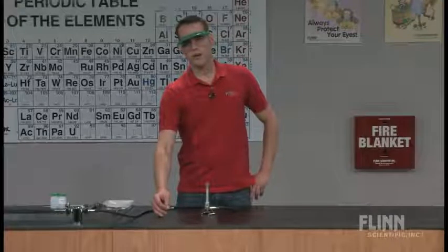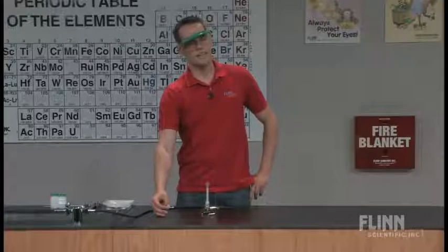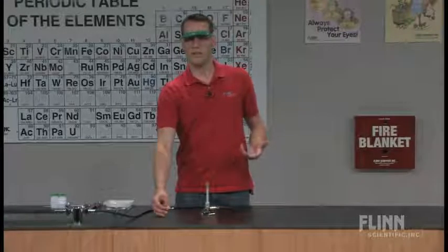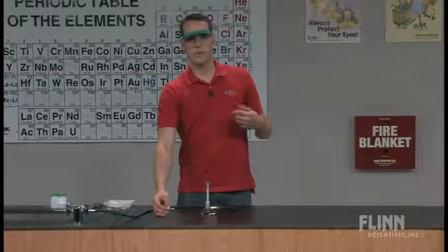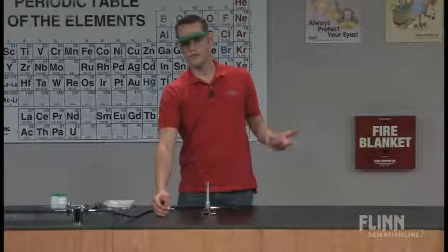I also found that through the teacher that I replaced at my current school that she did a really nice extension in her flame test lab. And I always strive to put real-world connections into what my students do in the laboratory. She found that by putting bananas into a flame test, you can actually test for potassium and sodium.